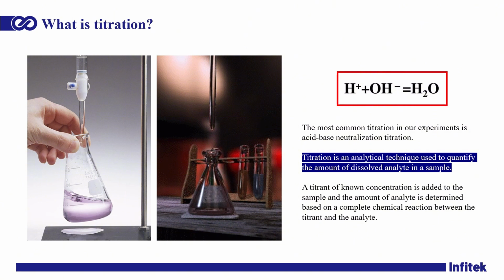So, what is titration? Titration is an analytical technique used to quantify the amount of dissolved analyte in a sample. A titrant of known concentration is added to the sample and the amount of analyte is determined based on a complete chemical reaction between the titrant and the analyte.